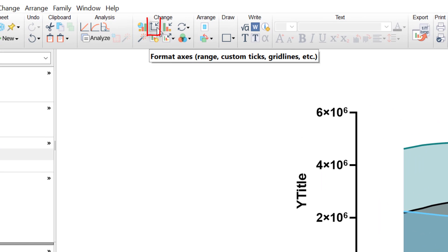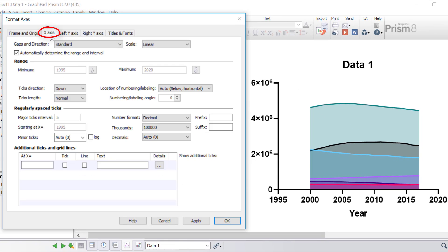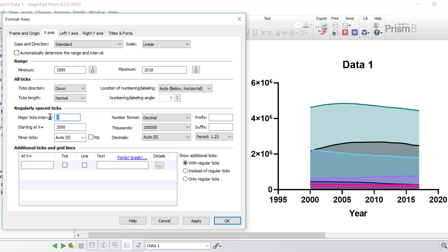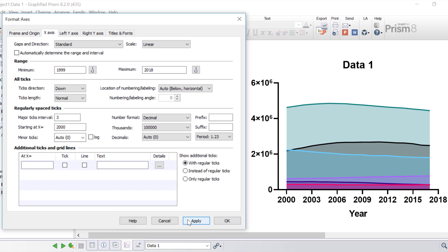So to format the axis on the graph itself, you want to click on the Format Axes button at the top, and I'm going to toggle to the x-axis tab to adjust the x-axis first. Usually GraphPad automatically determines the range and interval of the axes for your graph. But in this case, I'm going to untick this option. I'm going to change the start year to 1999, and my maximum or my end year to be 2018. And then what I'm also going to do is change the major tick interval to 3, and this means every third year will be labelled, and I'm going to start this at the year 2000. I'm going to click the Apply button. So notice now that that white space has been removed either side of the graph, so it's making good use of that x-axis.